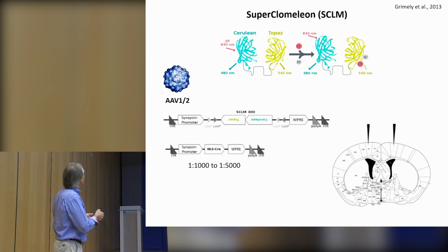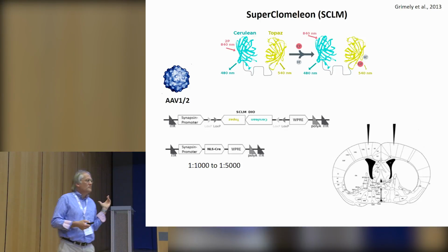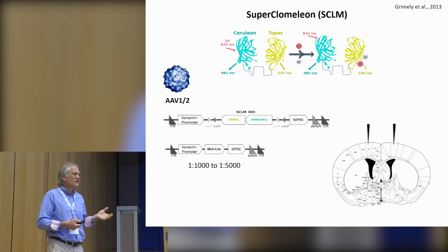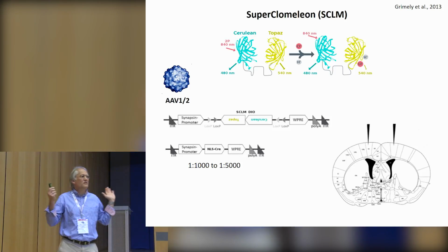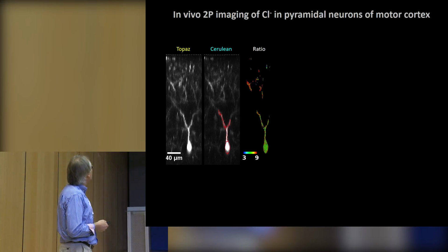So by using this cassette, you can use a strong promoter here that really gives rise to maximum expression levels. And as you know, in this expression system, the expression levels are strongly dependent on the multiplicity of infection, so that several virus capsids of the AAV infect the same cell, and that really boosts the expression a lot. And now by using this dilution approach, you can take advantage of maximal expression here. But for the Cre, of course, you need only a few molecules in order to exert the action. And so that's how you can easily control the density of expressed neurons.